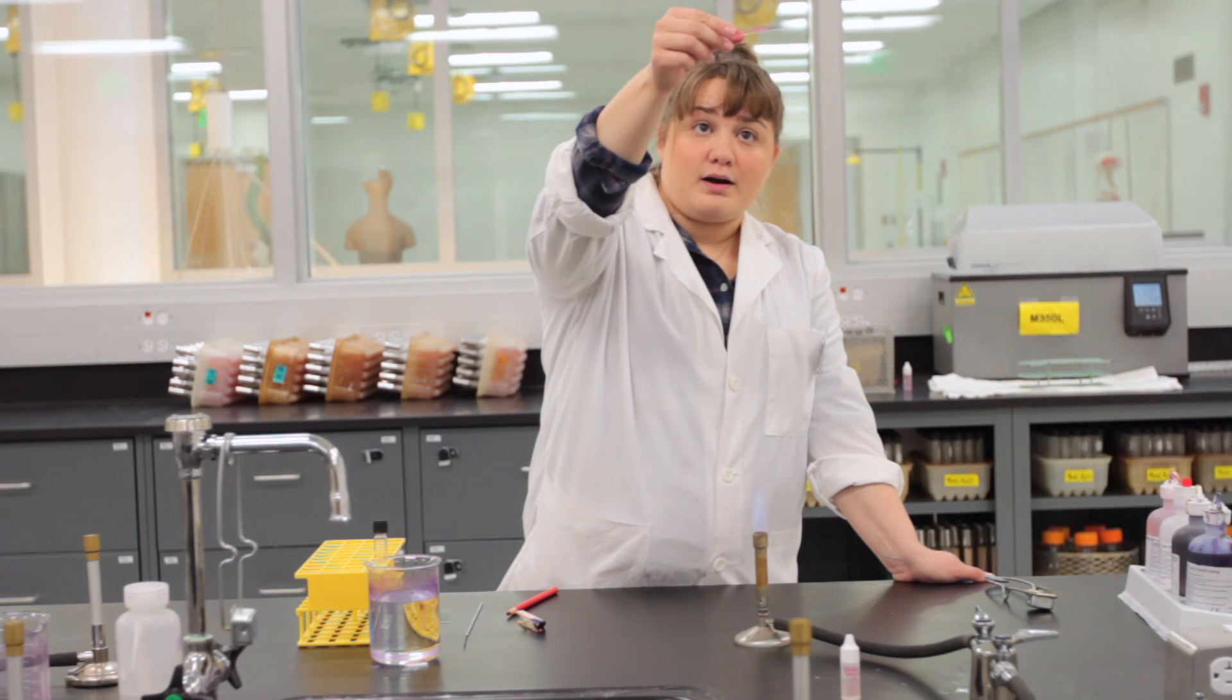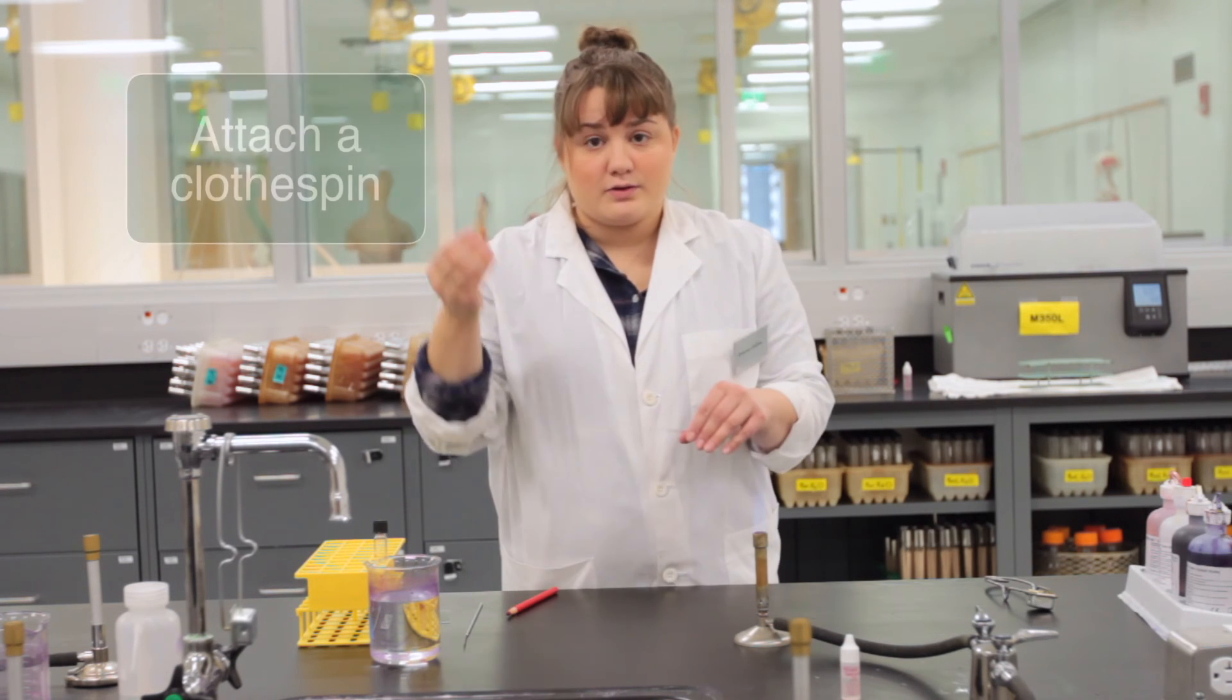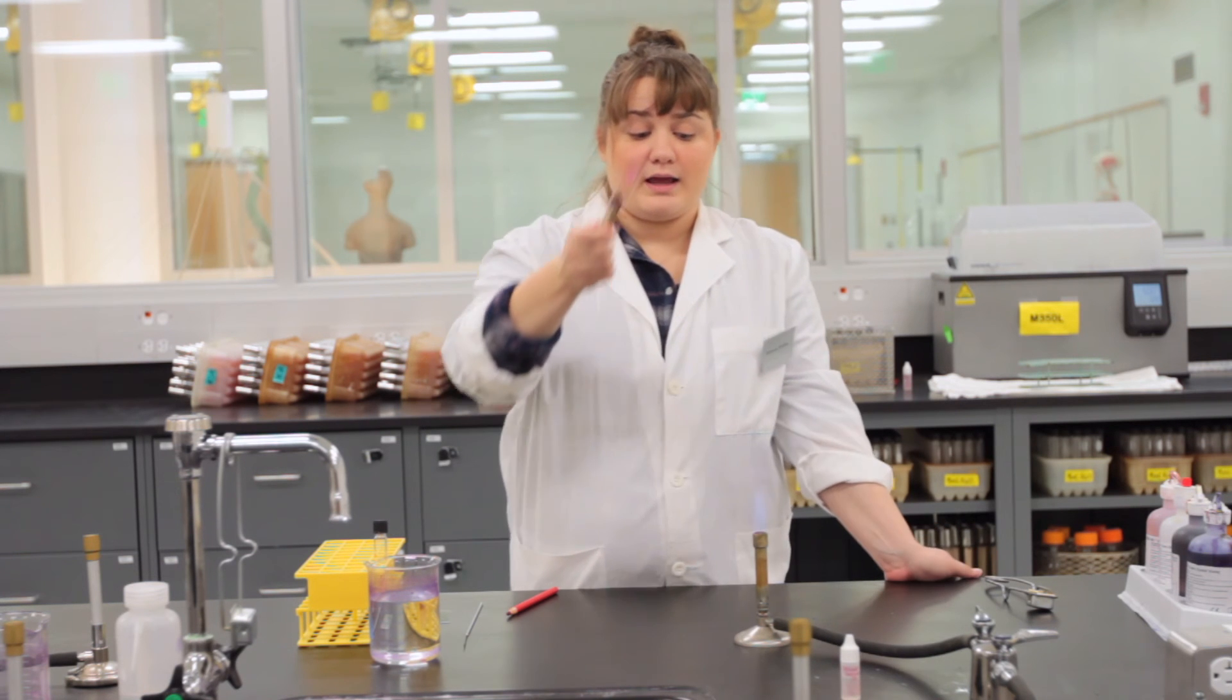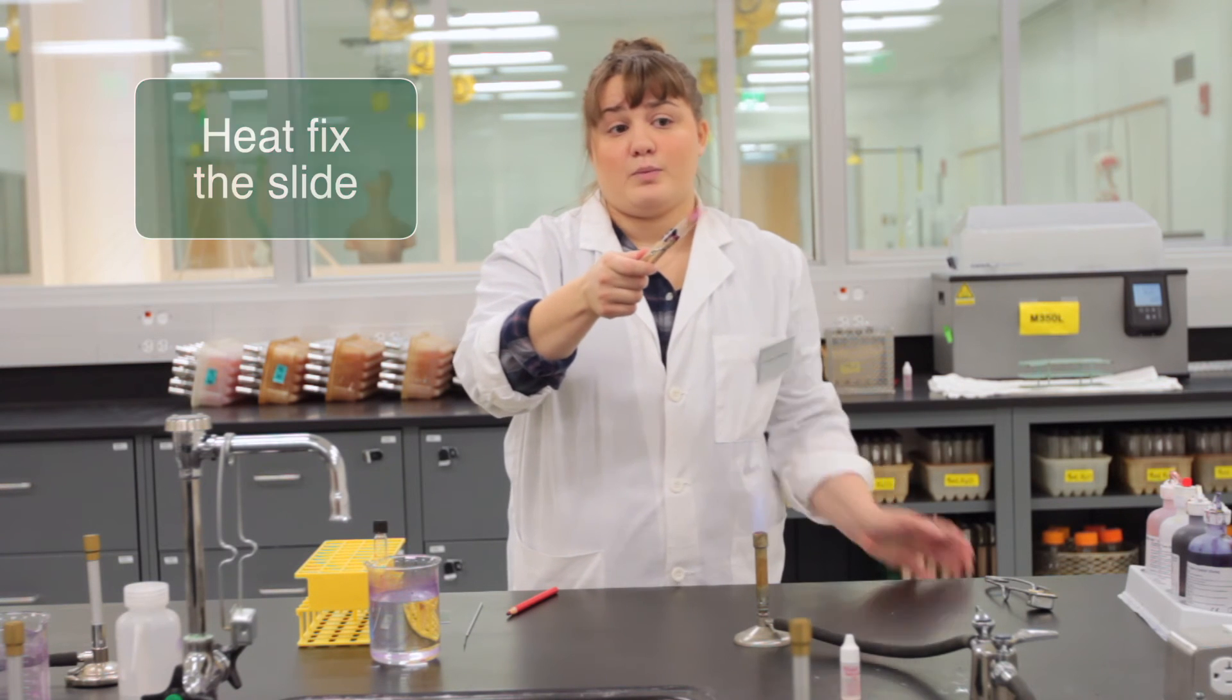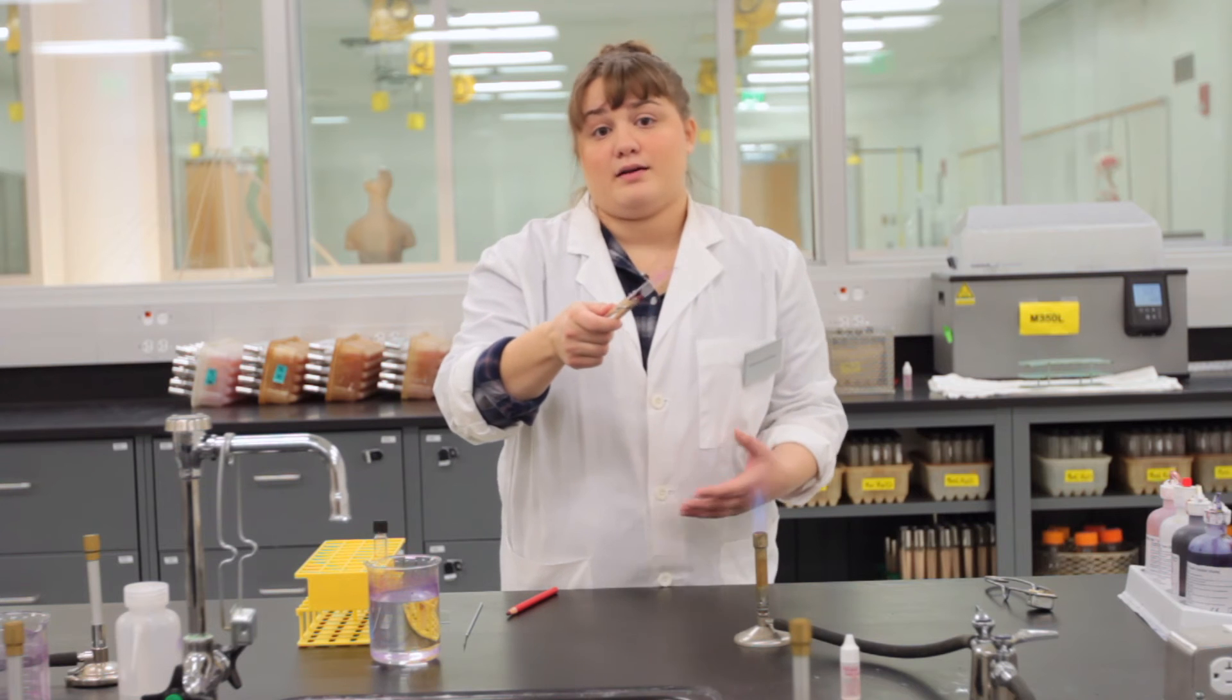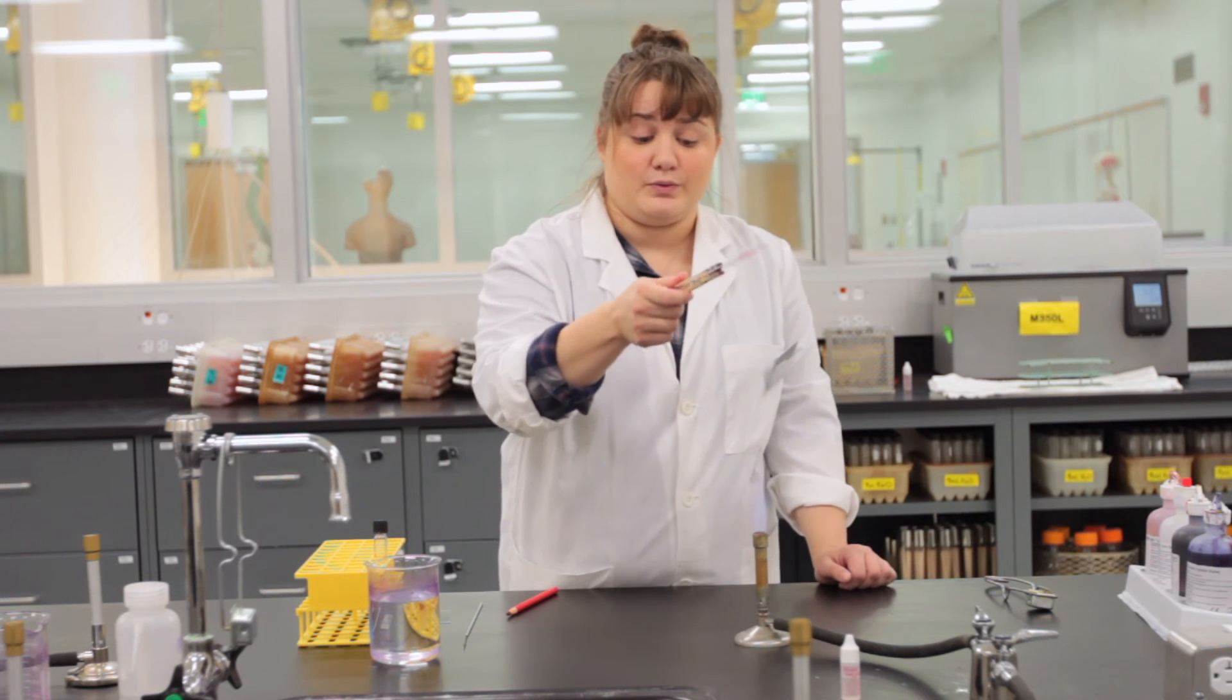Once the water has evaporated and the slide is dry, you will take your clothespin, attach it to the end of the slide, and you will send the slide through the flame three times to heat fix the bacteria to the slide. By heat fixing we are adhering the bacteria to the slide and it allows us to go through any staining procedures that we want to go through.